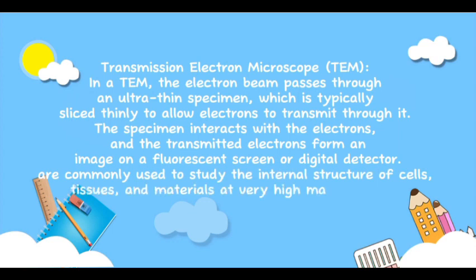The specimen interacts with the electrons, and the transmitted electrons form an image on a fluorescent screen or digital detector. TEMs are commonly used to study the internal structure of cells, tissues, and materials at very high magnifications.